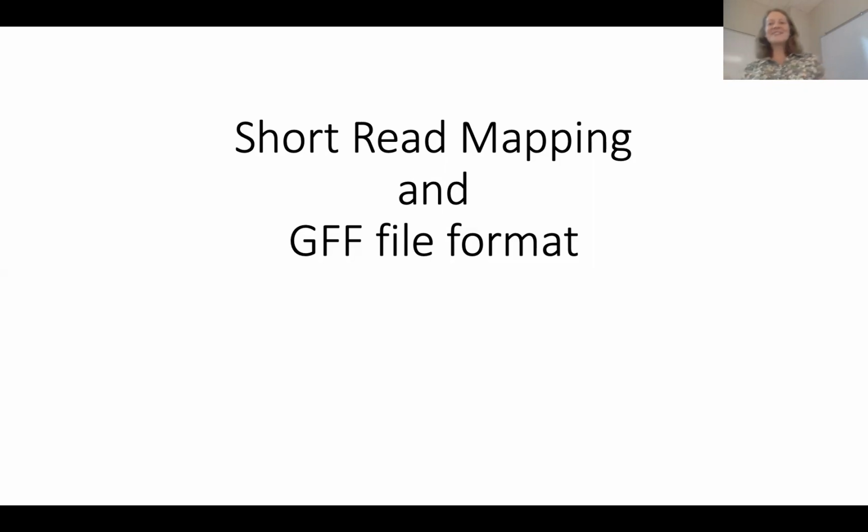So I wanted to give you a positive spin on today, like it's gonna be really fun, we're gonna map reads. The negative side of today is we're gonna be talking about a lot of really boring file formats. So you're just gonna have to try to stick with me on that and learn what we can. File formats are very boring, but they actually turn out to be incredibly useful when you're trying to actually do computational work. Most of the times because the file formats either are mislabeled or there's some discrepancy and you're the one who gets to go in and sort it out. So if you don't understand the formats, that can be tough.